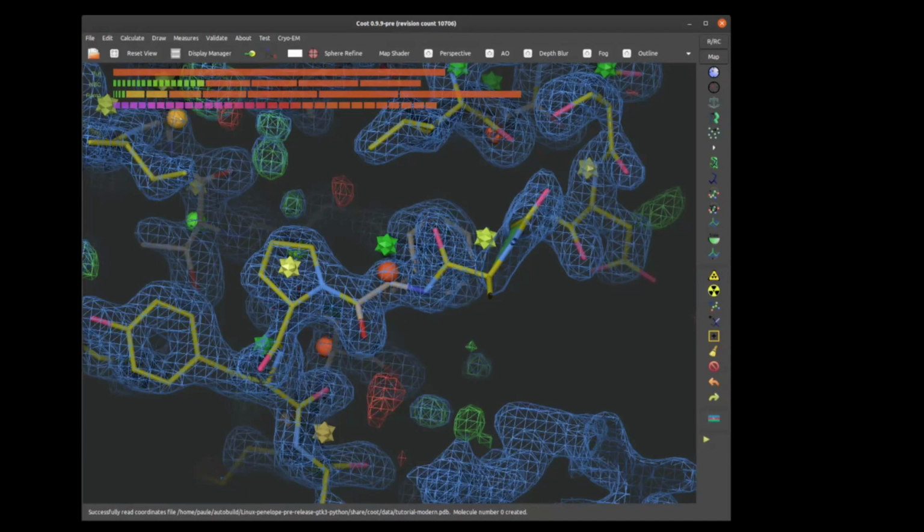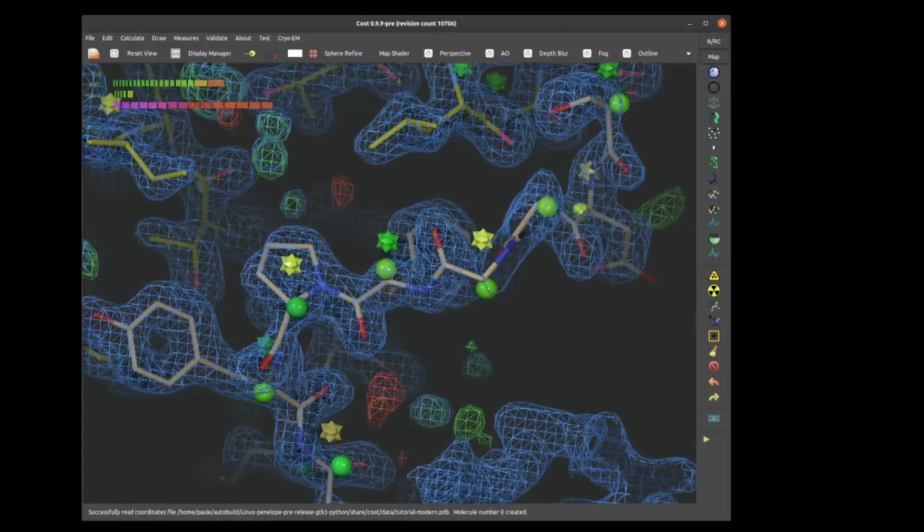If we want to adjust the model to make those contributions to the target function reduced, they're interactive, so you can click on them. And if we do so, and we let the refinement proceed, then we can get reduced health bars, illness bars, and the markup has gone green almost across the board. And so we will be happy with that sort of representation.